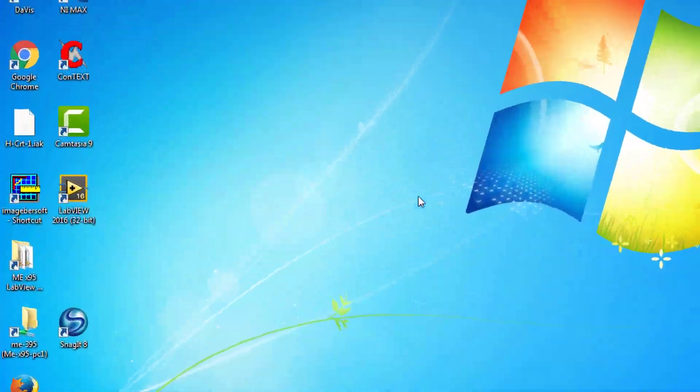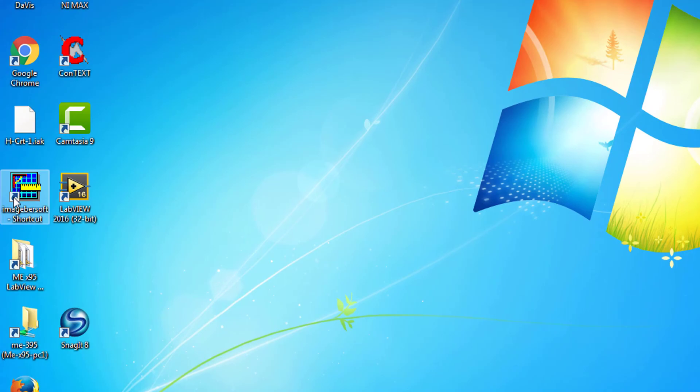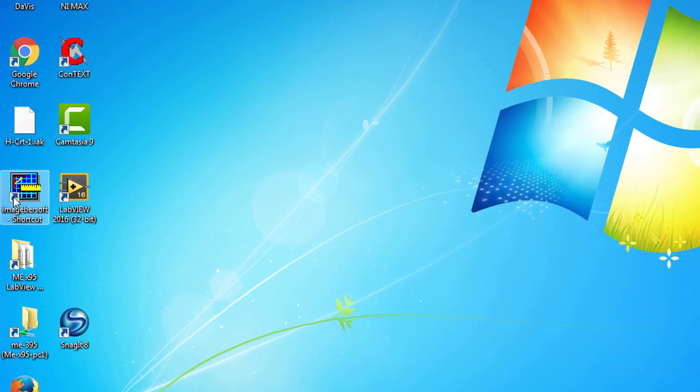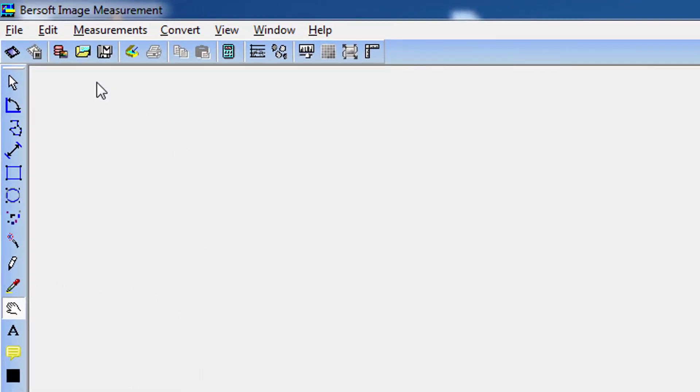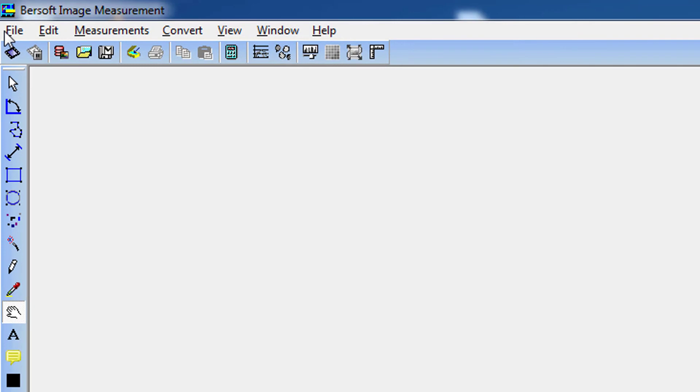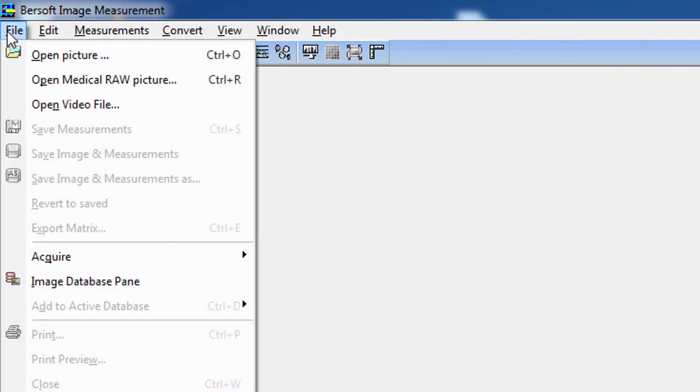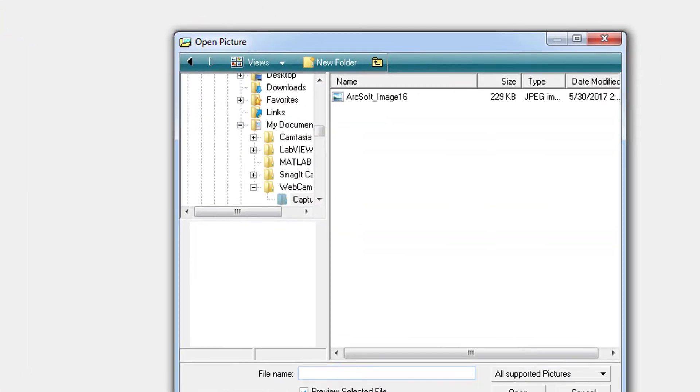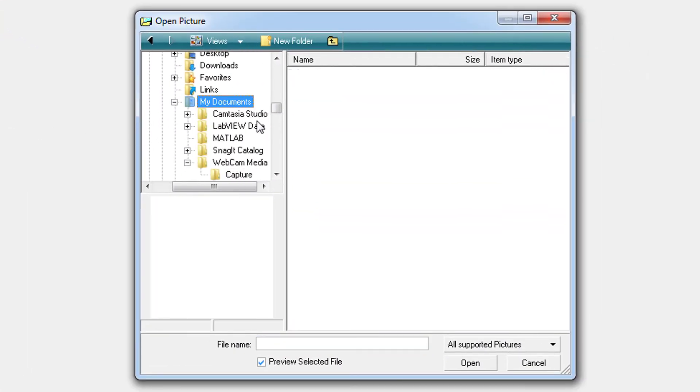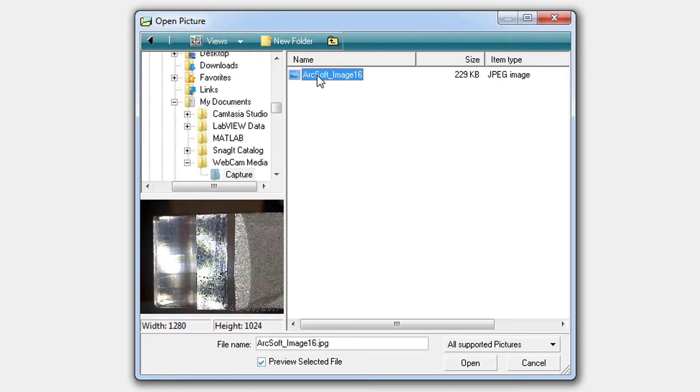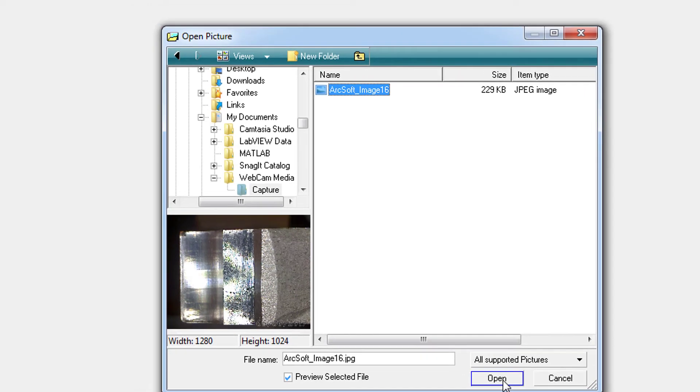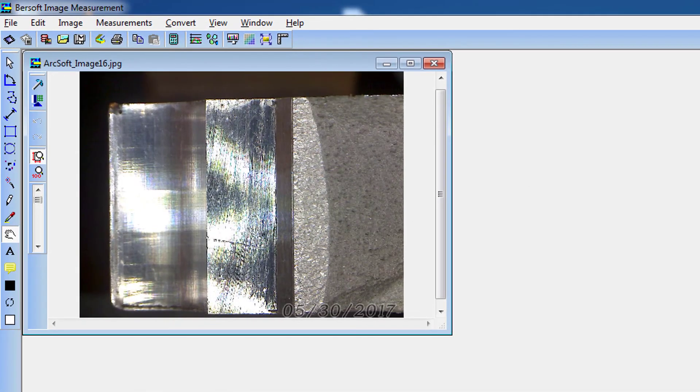Returning to the desktop, open the Bursoft image measurement software, which will be used to measure the crack length. Select Open Picture from the drop-down menu and navigate to the folder containing the recently captured picture. Select the image to open and maximize the image window.